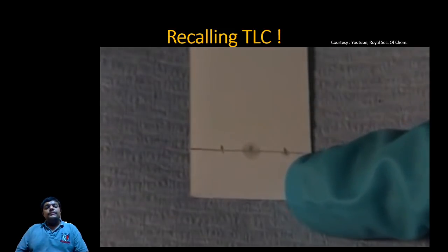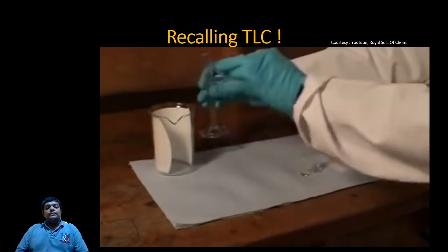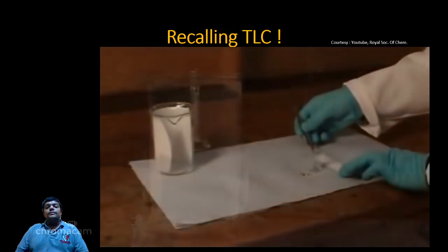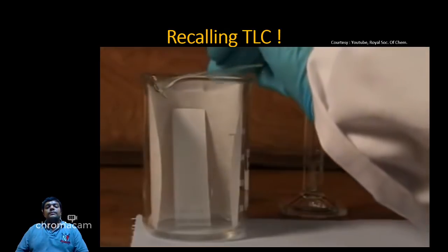Compare their RFs. We need to put the solvent into the chromatography tank to a depth of 3 to 4 millimeters. Usually you'll be told what solvent to use. Put the plate into the tank and put the lid on.